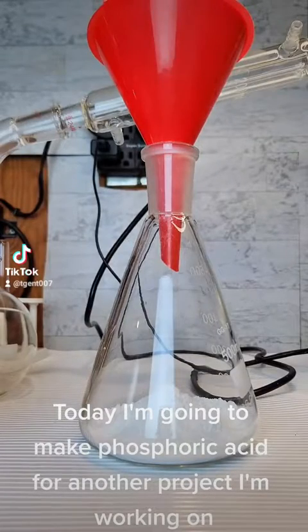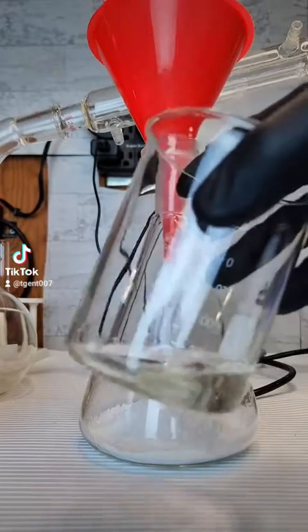Today I'm going to make phosphoric acid for another project I'm working on. This one is simple.